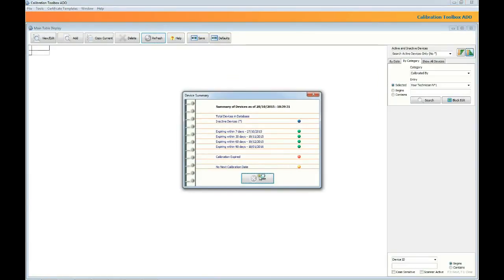and then we're going to have a look just to remind ourselves about calibration data templates, or as we call them in Pipette work, test plans. And then we'll have a little look just to introduce ourselves to the concept of the certificate template, and I'll show you an example of that and how you then import data from the calibrations into the certificate template.